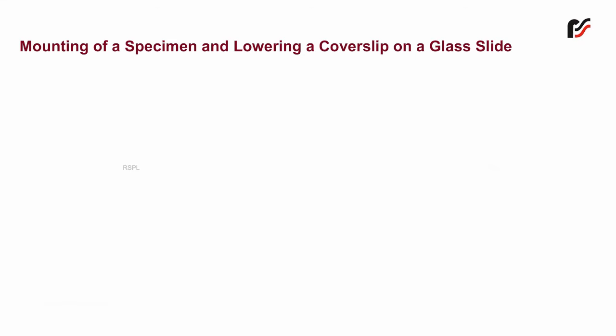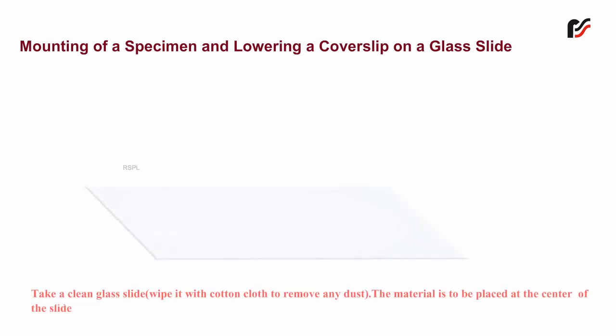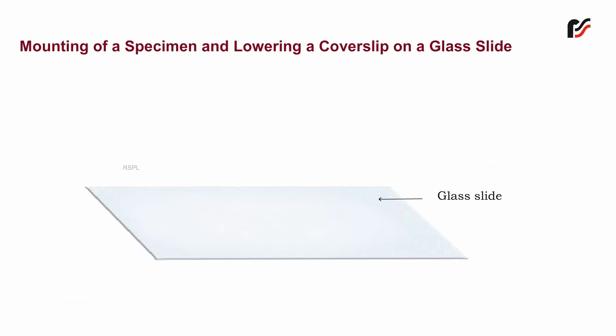Mounting of a specimen and lowering of a cover slip on a glass slide. Take a clean glass slide and wipe it with a cotton cloth to remove any dust. The material is to be placed at the center of the slide.